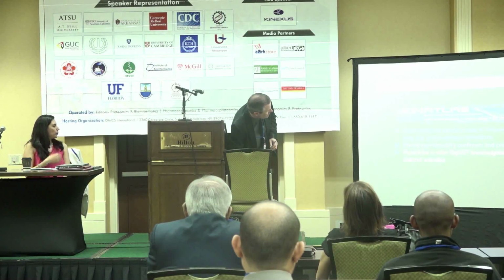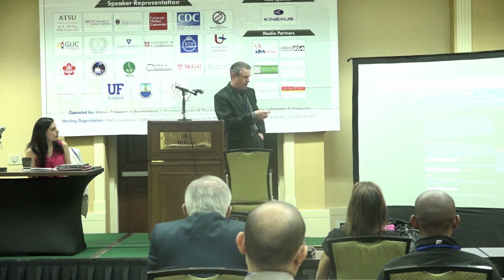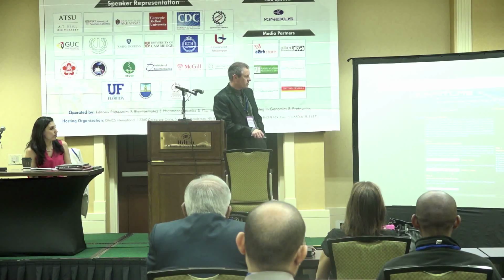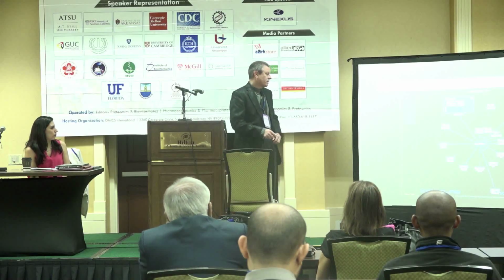Atlas is still in development. It will be online shortly. And it'll show experimental and predicted interactions. We have some of these maps already working, for example, for drug-protein interactions. You just put in the name of either the kinase you're interested in or the drug you're interested in, and then generate the map. And then you'll get a map which looks like this.